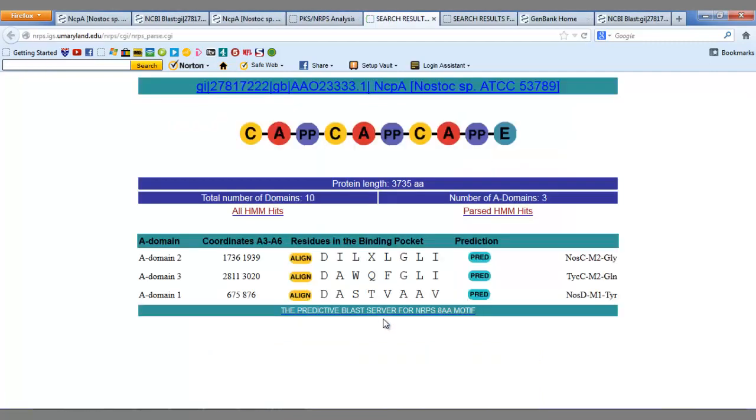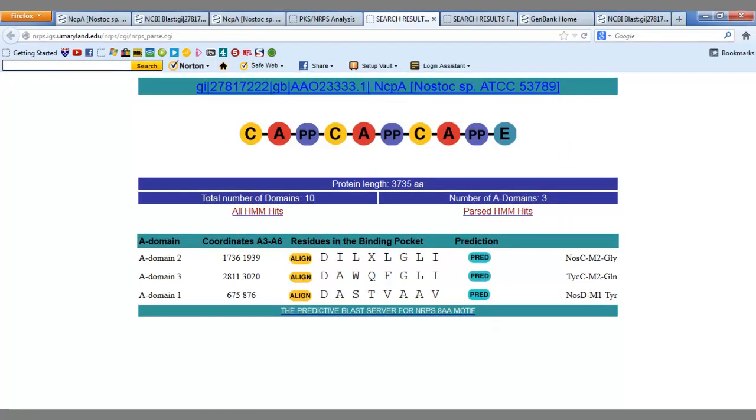This graphical representation shows a basic structure of what this region looks like. And as we can see, the domains that were present in the BLAST results are also present here. Therefore, we can confirm with great accuracy that this sequence is a non-ribosomal peptide synthetase.